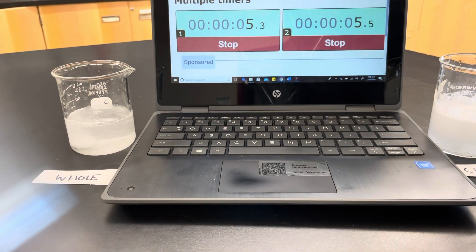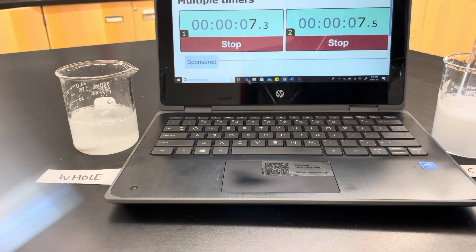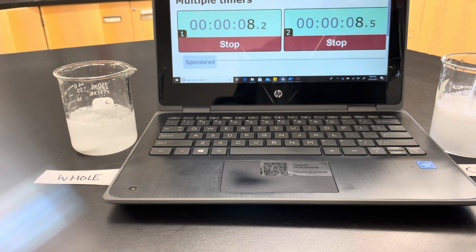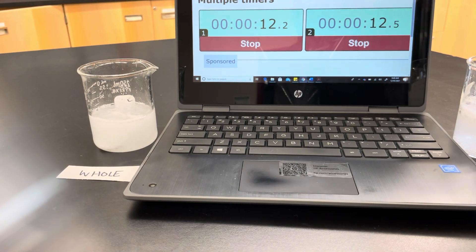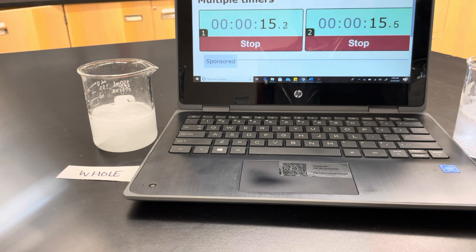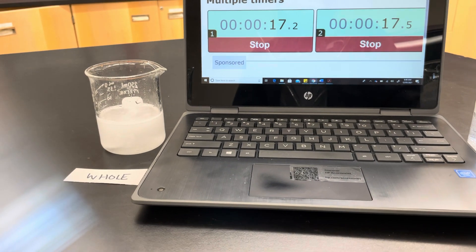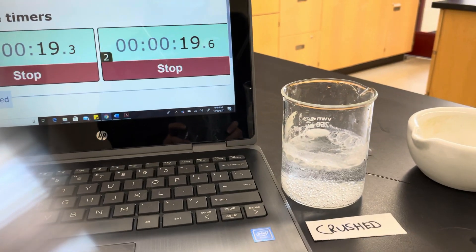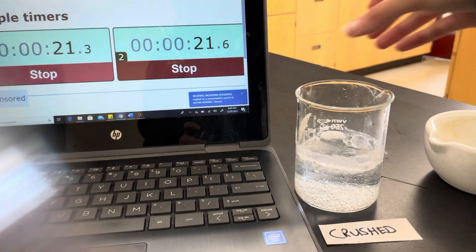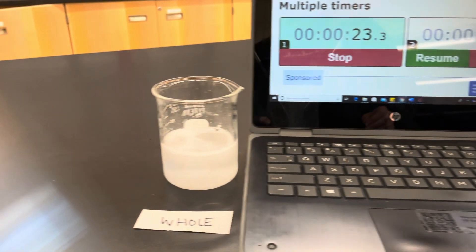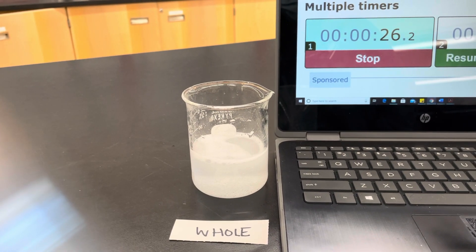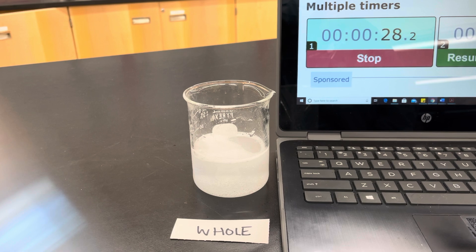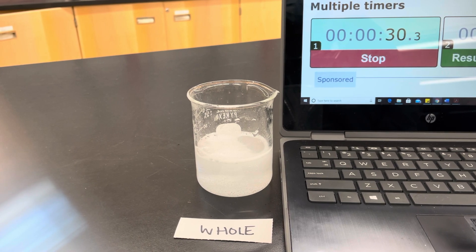We need to give this one a little bit of a swish just to make sure, because the one on the left is completely submerged, so we need to make sure the one on the right — all the little itty-bitty particles — get submerged as well. You can see the one that was crushed has already disappeared, so we'll watch and see how long it takes for the whole one to finish up. It's actually going pretty quickly.